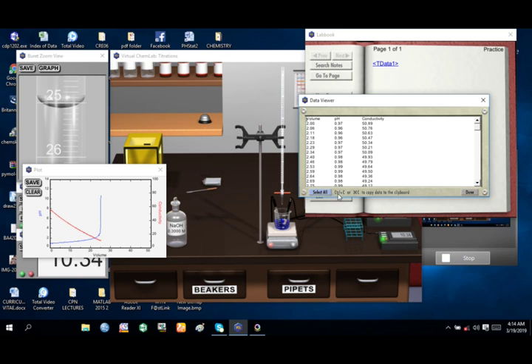Some other time we'll discuss how some of these data can be analyzed using an Excel program. Now, having gotten the results of our titration, how do we dispose of the experiment?